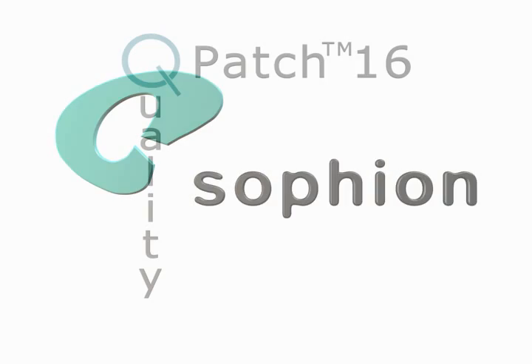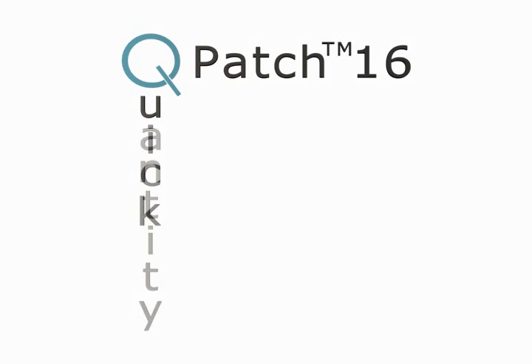The Q-Patch. Quality, quantity, and quick.